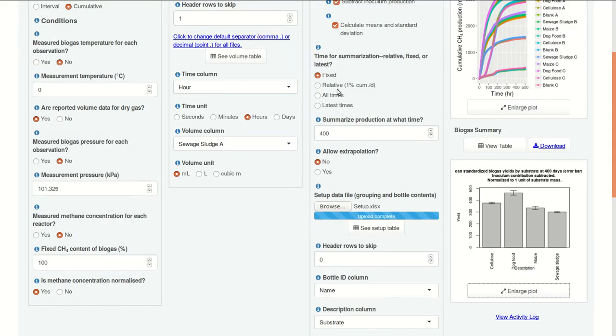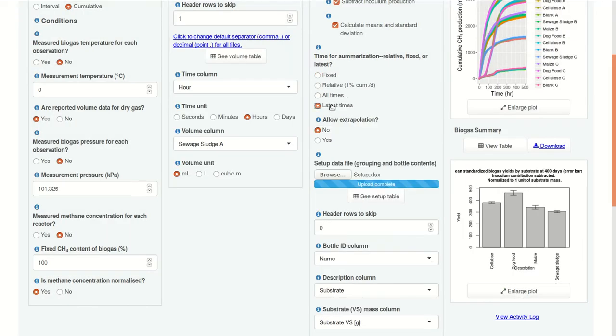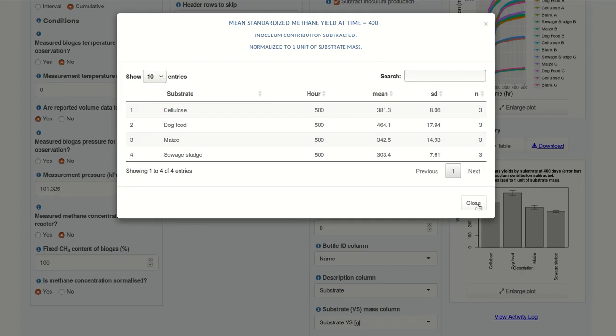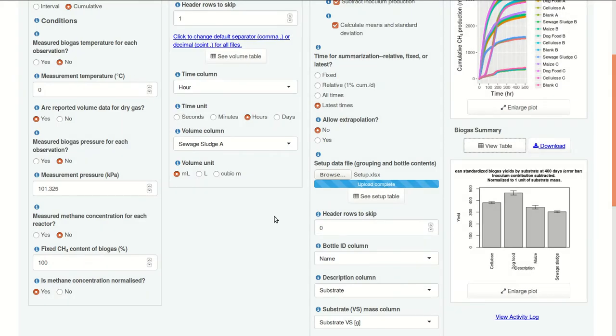We could select a different time, or we could just say, use the latest times. So, this will switch to 500 hours. And we see the BMP values increase, of course, because now there's a bit more biogas produced.